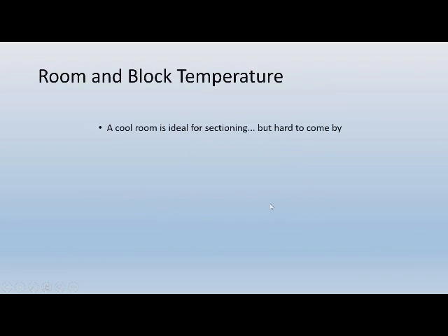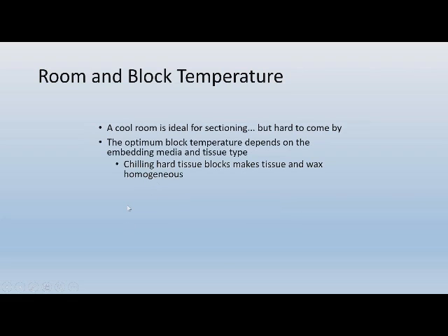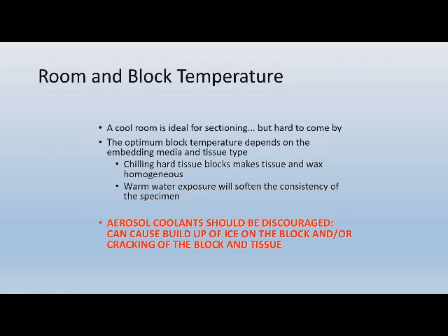Room and block temperature, of course, are important. We want our room to be cool. Sometimes we can't get that, but it's nice when it is. The optimum block temperature depends on embedding media and tissue type. So if we chill our hard tissue blocks, it makes tissue and wax homogeneous. Warm water exposure will soften the consistency. Aerosol coolants really should be discouraged. They can cause buildup of ice on the block and or cracking of the block and tissue, and you can actually lose tissue. So you might want to use that sparingly, only if you have to.